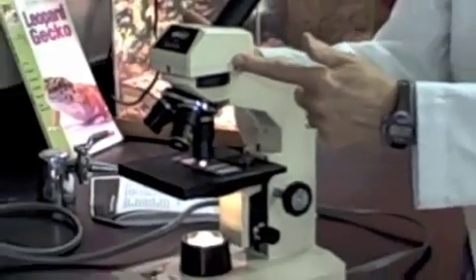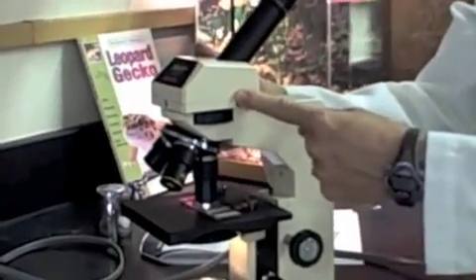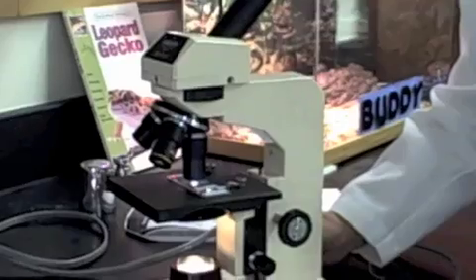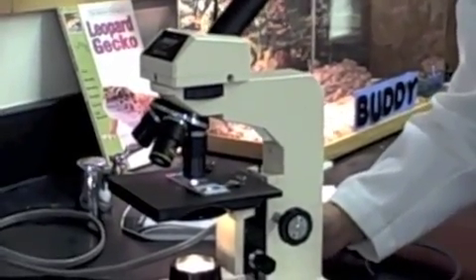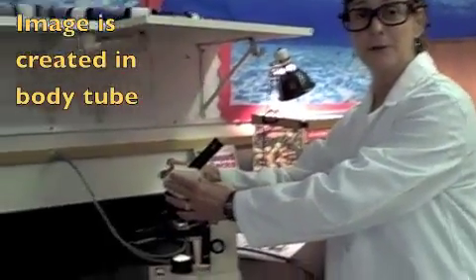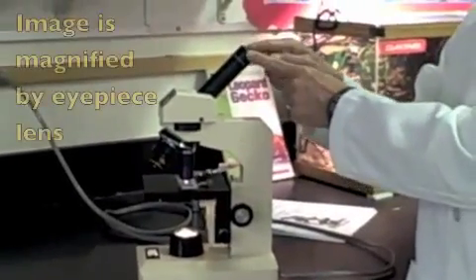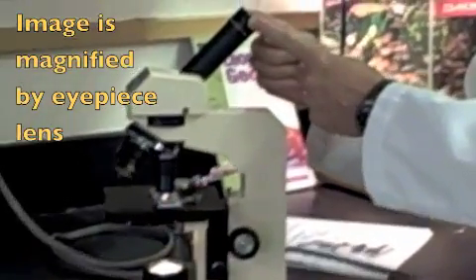Students, can you please locate the body tube on your microscopes. So now we have an image that's created in the body tube. That image gets magnified by this lens called the eyepiece lens.